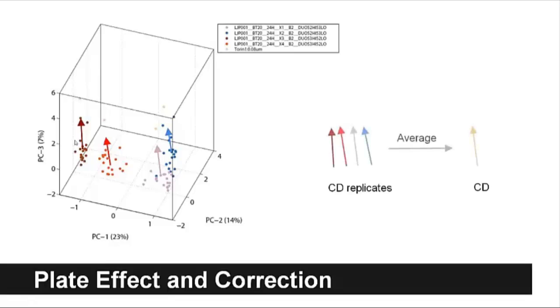Can I ask you just a very quick question? Is it just quantile normalized observations? Yeah, these are quantile normalized data. Okay, but not z-scores? Not the z-scores. We started from level 3, which are normalized data, and we derive our own signatures. Nothing related to z-score.